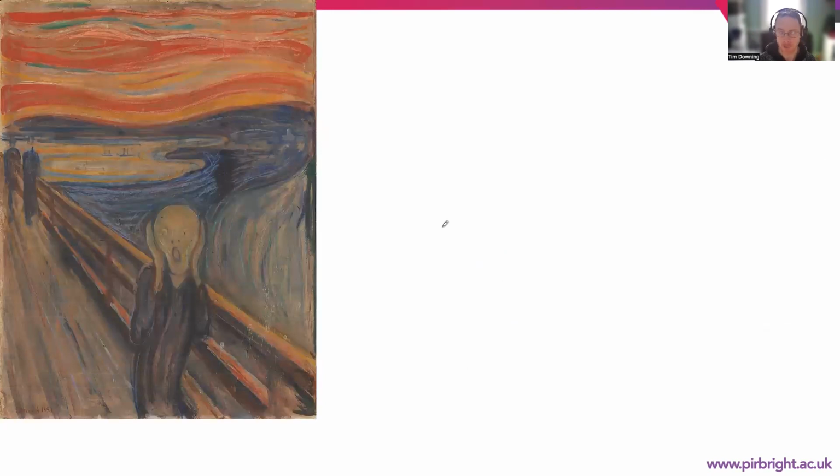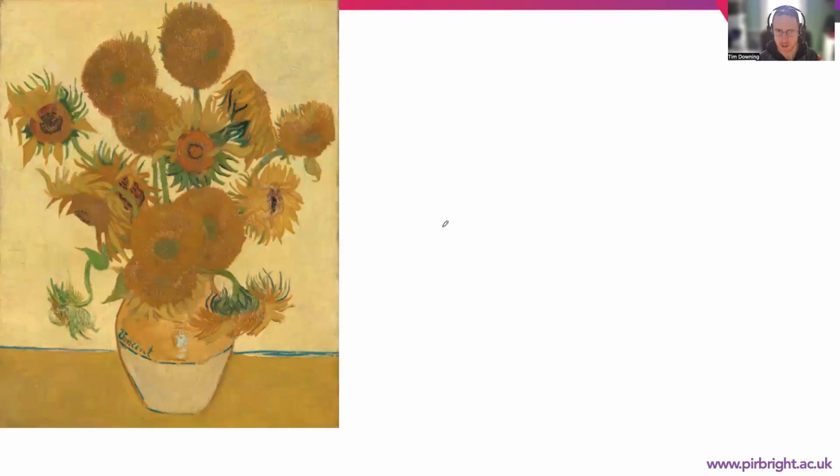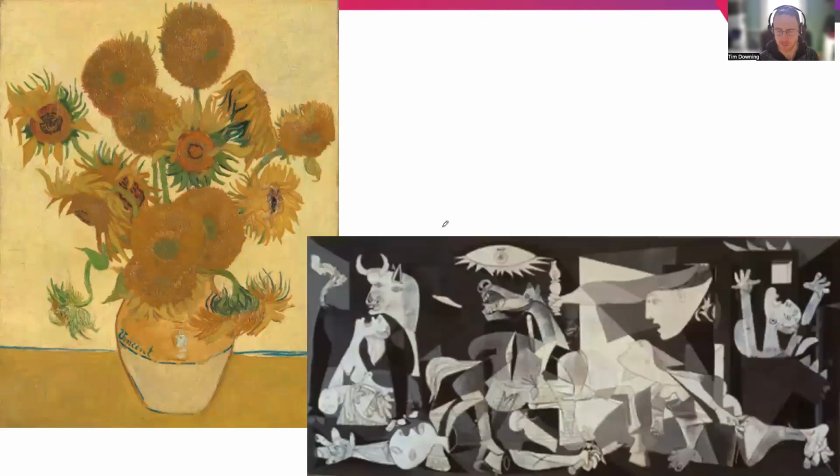So people might have red-green color blindness, and then also how different images can identify different features in different ways, and tell us more about what's going on. You can see that the images being shown here are all quite different, have different meanings, and those meanings are interpreted by the person viewing them, and that's similar to what we are doing in a sense. We're trying to make interpretable images that may have meaning for the viewer.